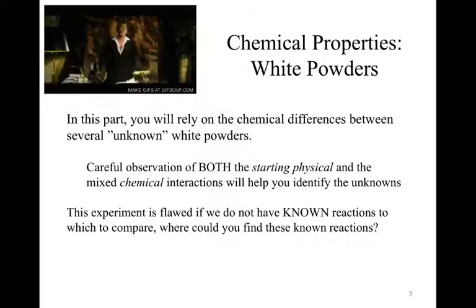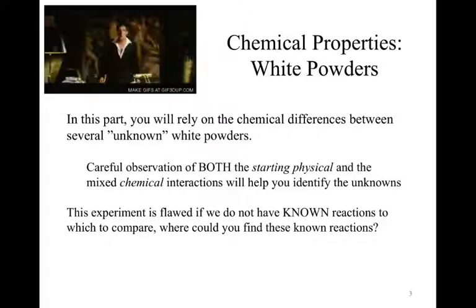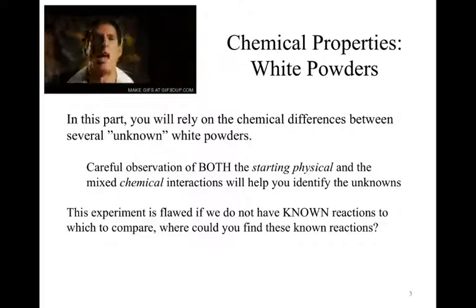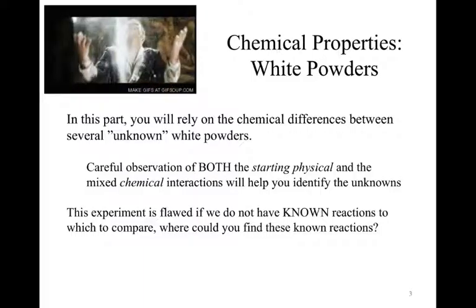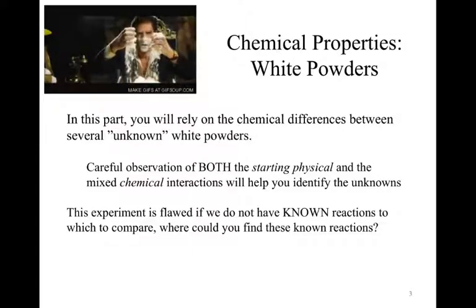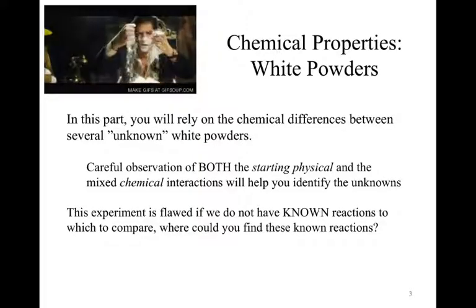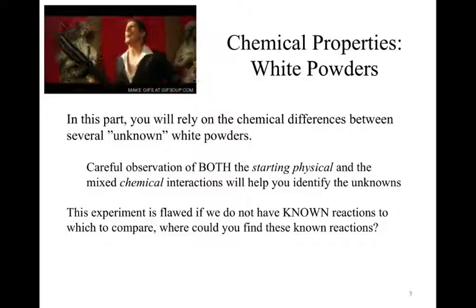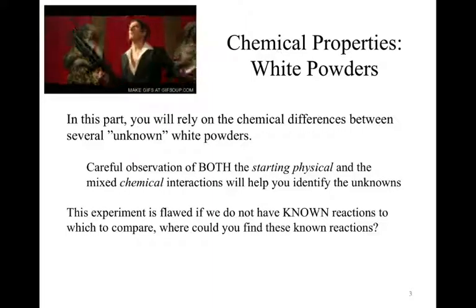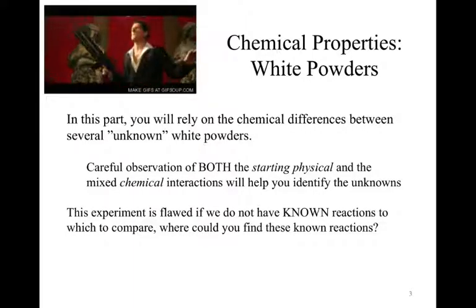This experiment is also flawed if you do not know what the known reactions are. So if we gave you a thing of salt, how would you know it's salt? Remember, you can't taste. Hopefully you heard that already in a safety talk. Don't taste stuff. You would know it's salt based off of your interactions with salt in the past. If you don't have that yet, we need to know what those known reactions are. So maybe looking up what these chemicals are ahead of time could help you out. Or maybe you should do a very careful and thorough reading of the background information, because maybe it'll give you some information to start off with.